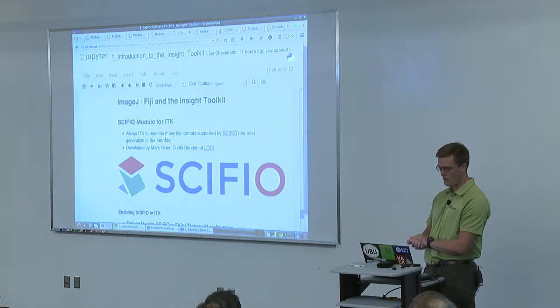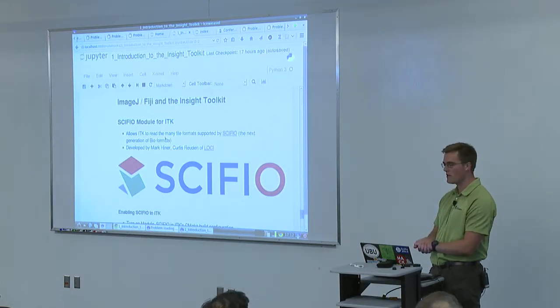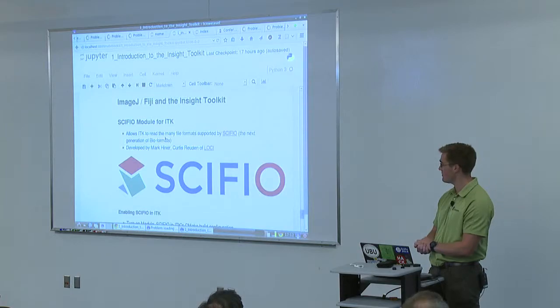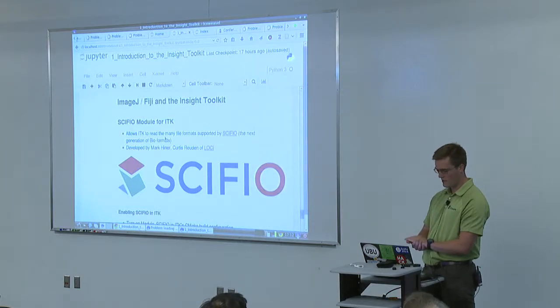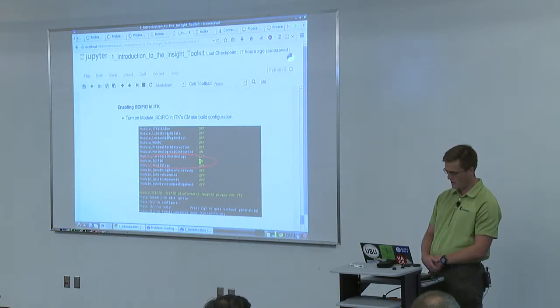And I think Curtis mentioned today in passing that someone should consider, on your next grant, hiring a programmer to help with your work and then also to help contribute to the maintenance of ImageJ and Fiji. I think that's a really good idea, and please consider doing that. I think people should take that seriously, and do as much as you can to support the great community-driven development that's happening here.